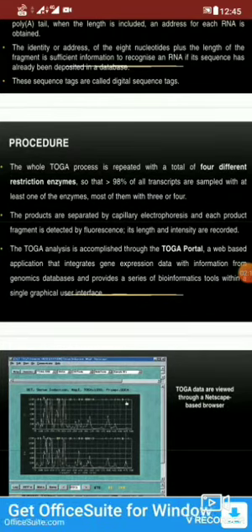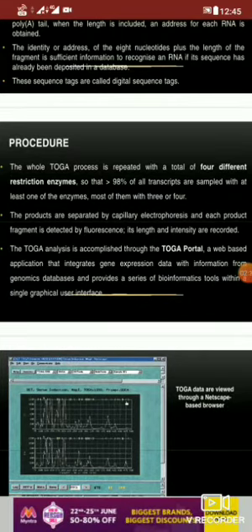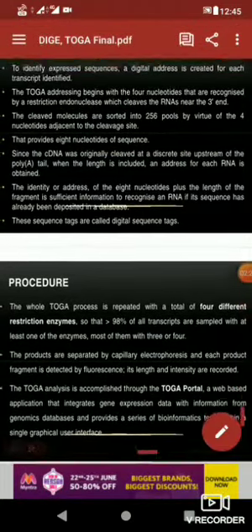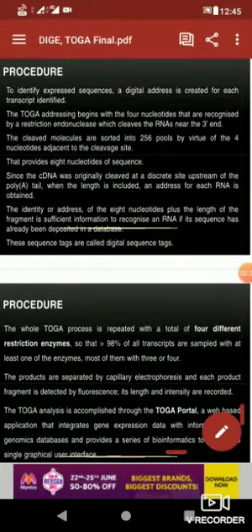And these sequence tags which are produced are called... okay, now here one more thing which you need to know is, when you are amplifying, one second. Initially we saw that the entire mRNA was converted to a cDNA, and we cleaved this cDNA with the restriction enzyme and took only this portion for our next step.